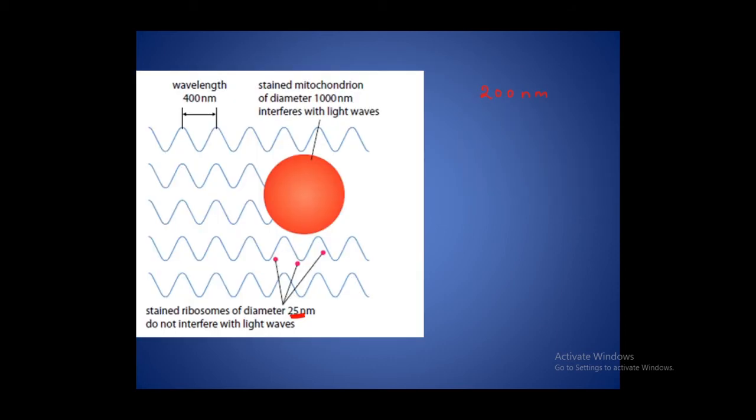Now why are electron beams used and why was it successful? Because electrons, as we know, are negatively charged, and these electrons are a part of an atom. And whenever we heat any metal, these electrons just escape from their orbits, and when they are escaping, these free electrons actually behave like an electromagnetic radiation.